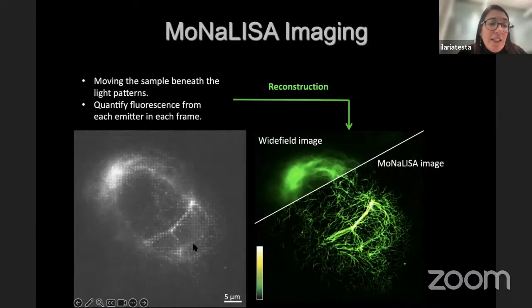And this is a little bit what the data look like. Because we have microlenses, you see these dots. Then what you do, conceptually, is exactly like you do in confocal microscopy. You integrate the signal and you reassign it to a pixel.